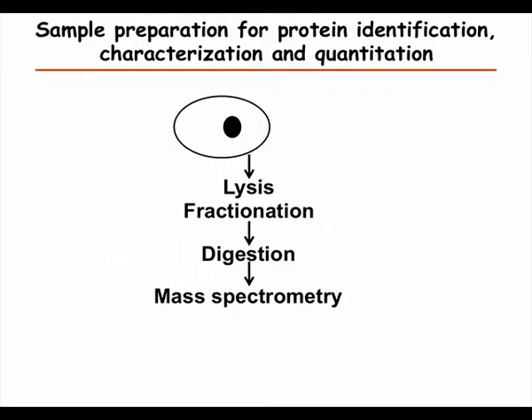So if we look at the steps to prepare a sample for mass spectrometry, we start out with the tissue or cell culture, and then first you have to lyse the cells and extract the proteins. And here there can be quite large losses. So if you start from tumor tissue, for example, from a biobank, the yield of proteins could be as low as 1% or sometimes even less. But usually with cell culture we can get quite good yields.